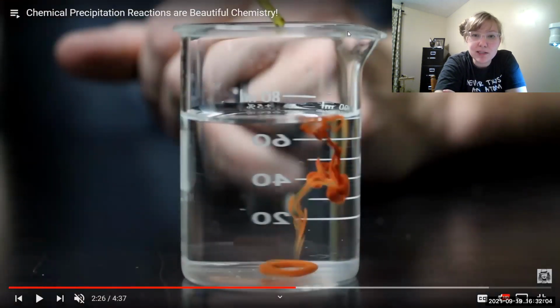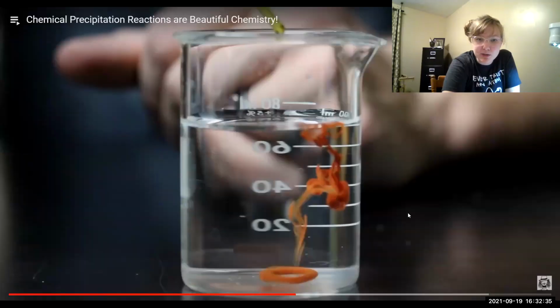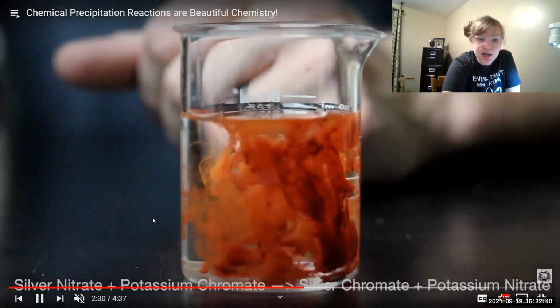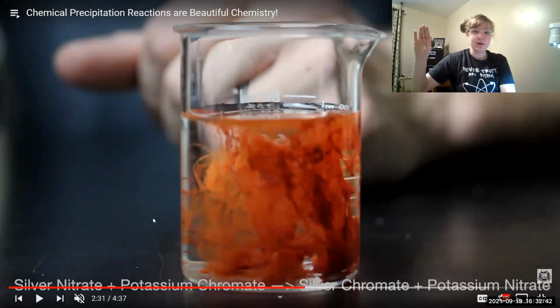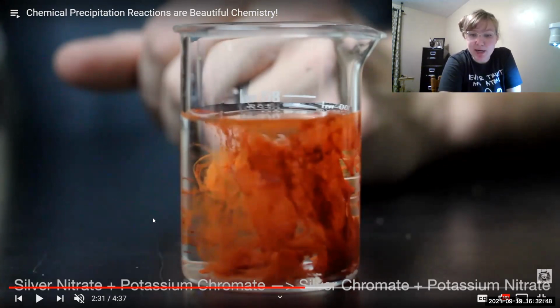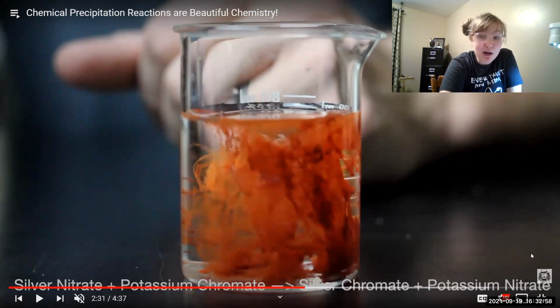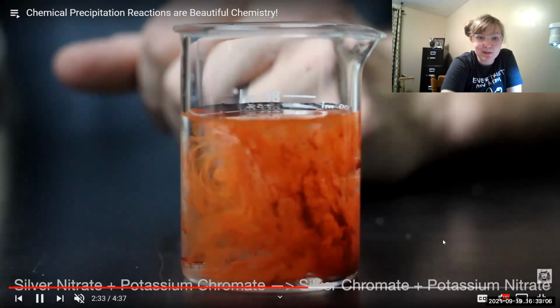Okay, back to that video because it was really cool. Here's another one that's happening. We have silver nitrate and potassium chromate. Those two aqueous are mixing together to make potassium nitrate and silver chromate. I'm thinking the silver chromate is that orange because the potassium nitrate, nitrates are always soluble, and potassium is in the +1 column. It should also be soluble. Looks so cool.